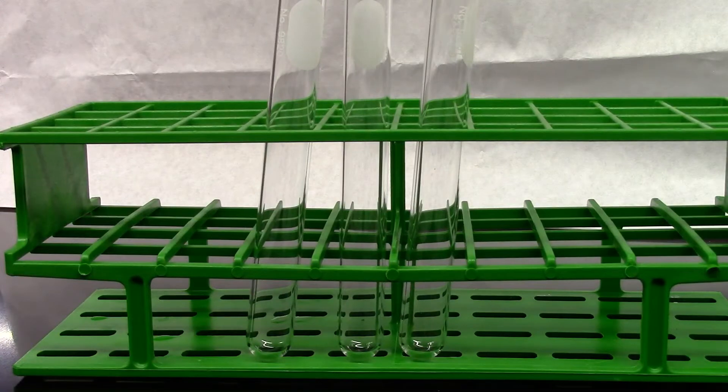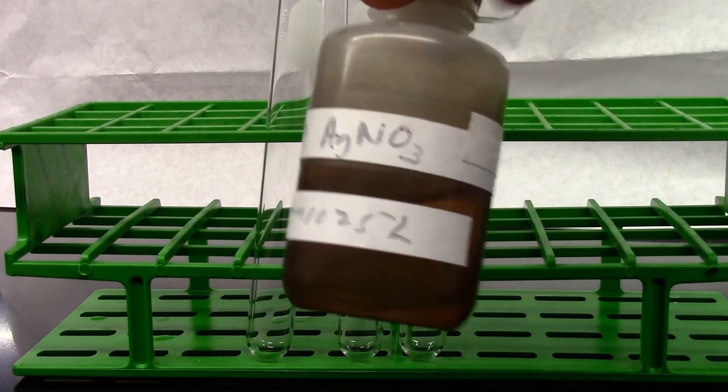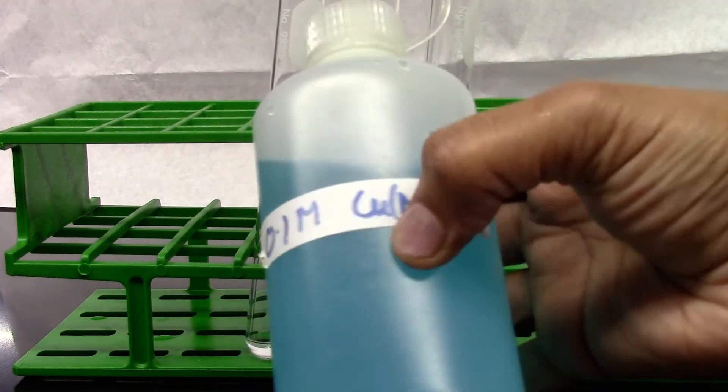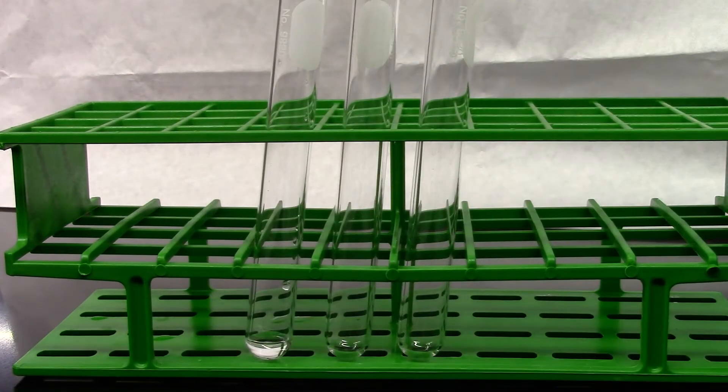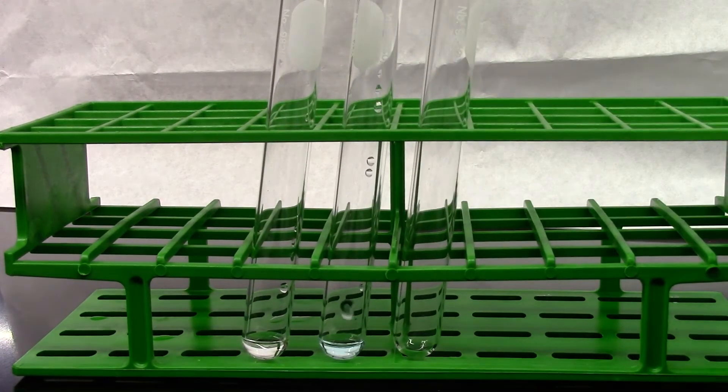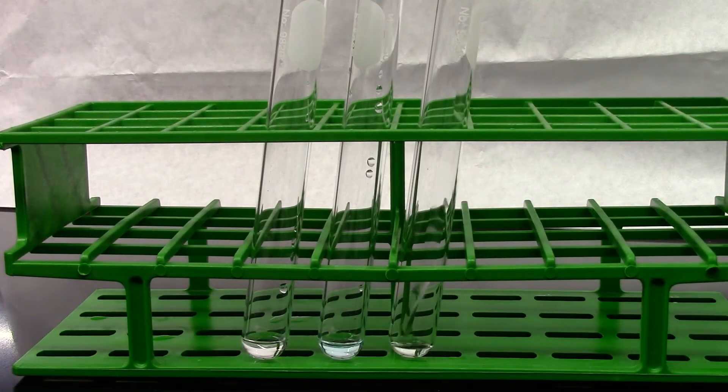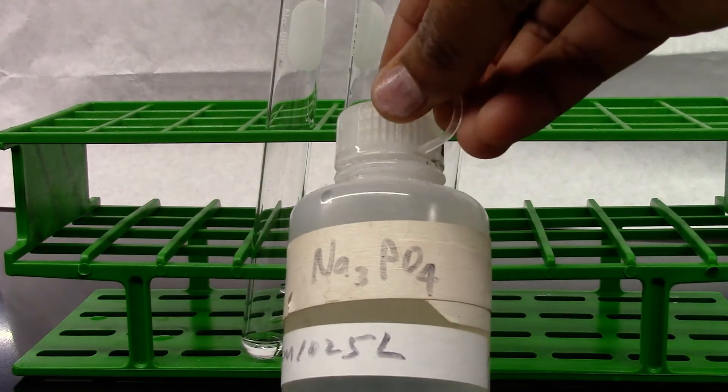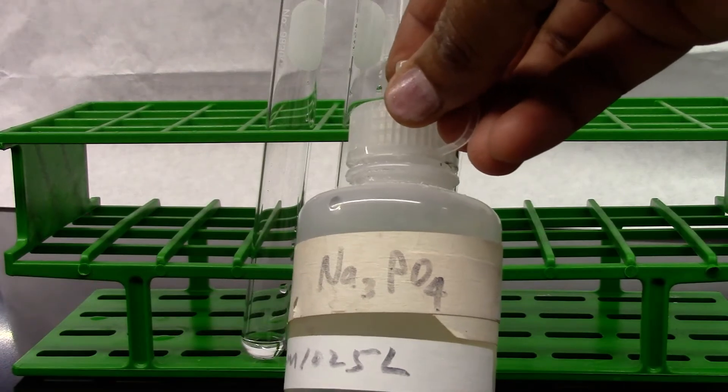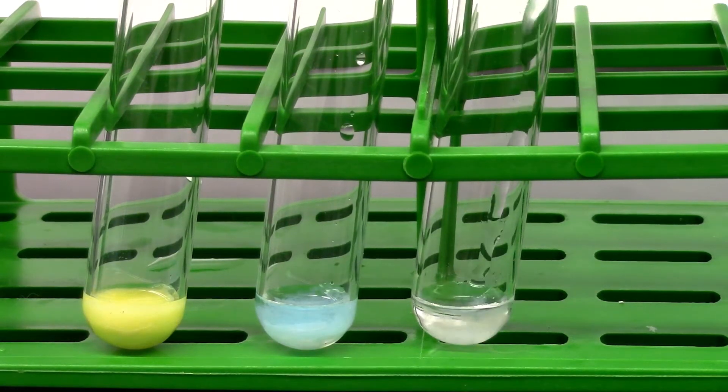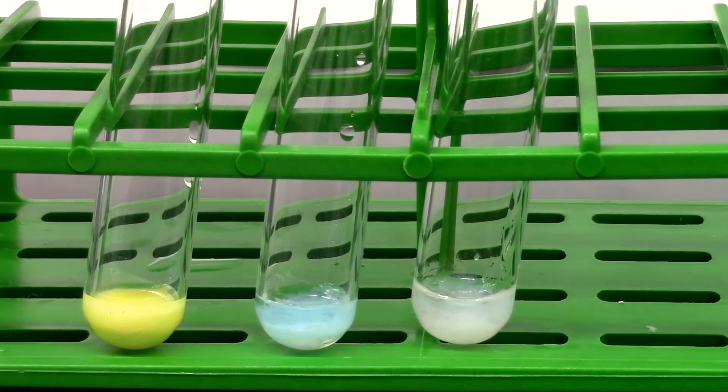So I have three test tubes. The first one I will be adding 10 drops of silver nitrate. Second test tube I'm adding 10 drops of copper nitrate. Third test tube I'm adding 10 drops of aluminum nitrate. To each of these test tubes I'm adding a few drops of sodium phosphate. All three test tubes have precipitated. Record the observation.